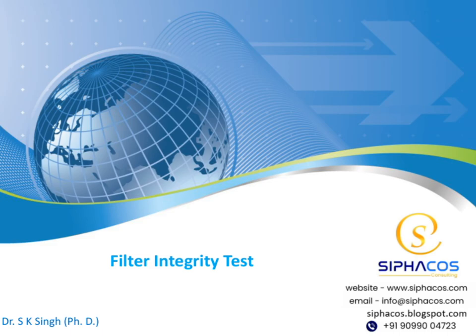Today, we will be talking about the filter integrity test, a crucial aspect in ensuring the quality and safety of our filtration systems. This presentation will cover the fundamentals of filter integrity testing, the importance of maintaining filter performance, and some practical insights into conducting these tests effectively. So, let's get started and explore this important topic together.